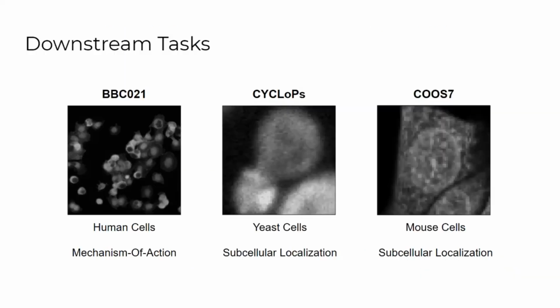We compare features extracted from a CytoImageNet pre-trained model, an ImageNet pre-trained model, and a randomly initialized model on 3 downstream microscopy classification tasks. Together, these transfer tasks test the performance of these features on different organisms, on fully imaged versus single-cell images, and on 2 different classification problems. Image labels are predicted using k-nearest neighbors on extracted features.